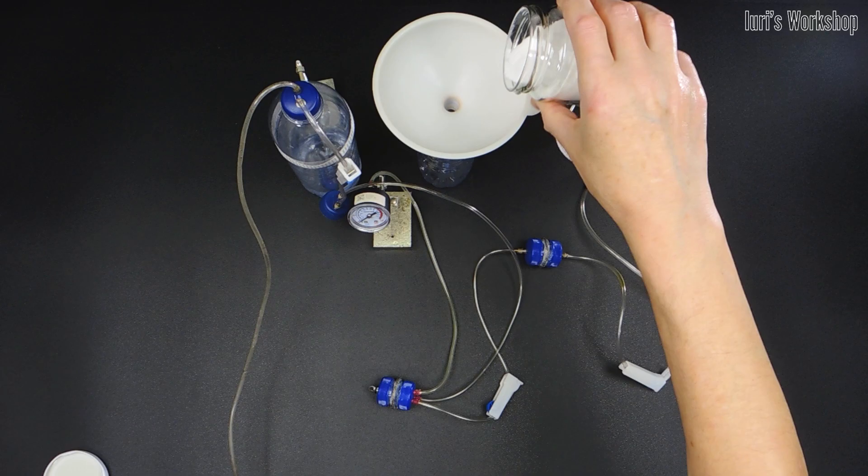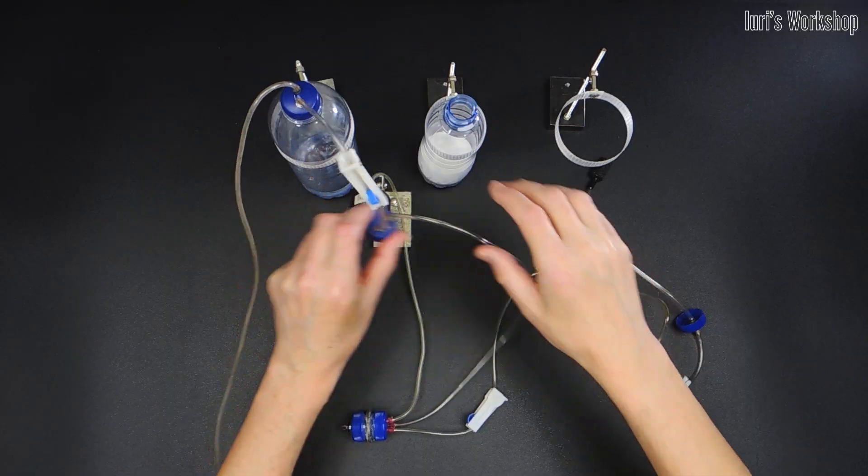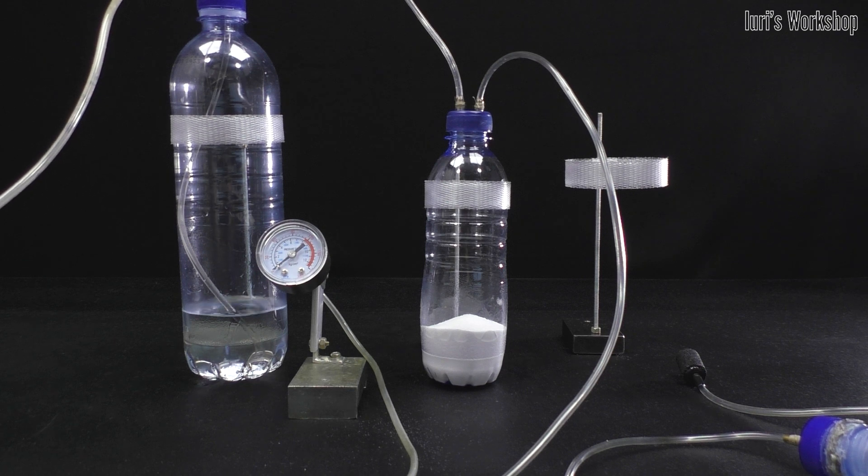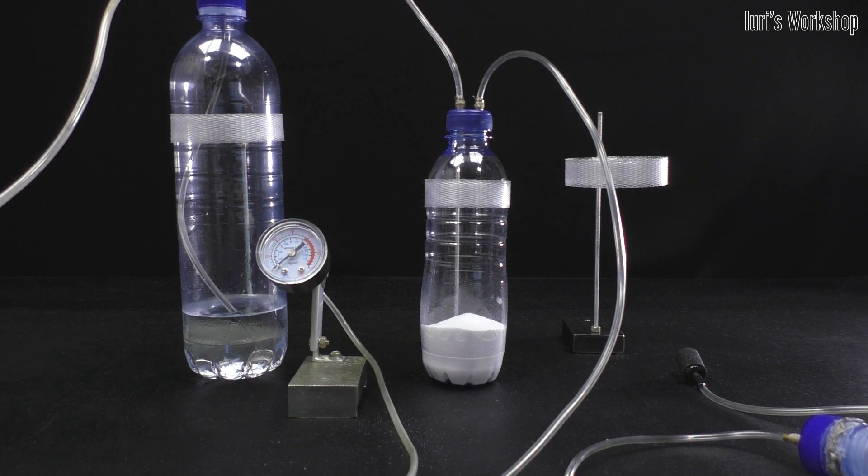In tank number 2, we put sodium bicarbonate, which is common baking soda. Then we increase the air pressure in the acetic acid tank to 5-6 atmospheres.